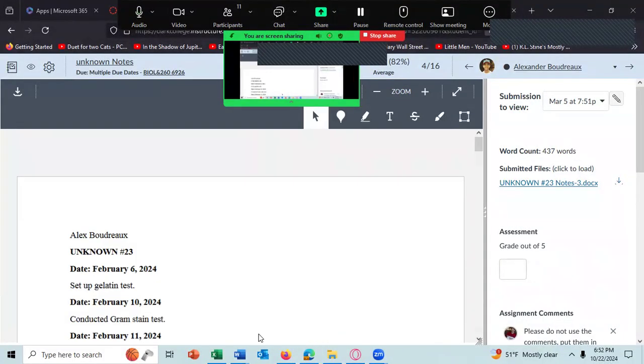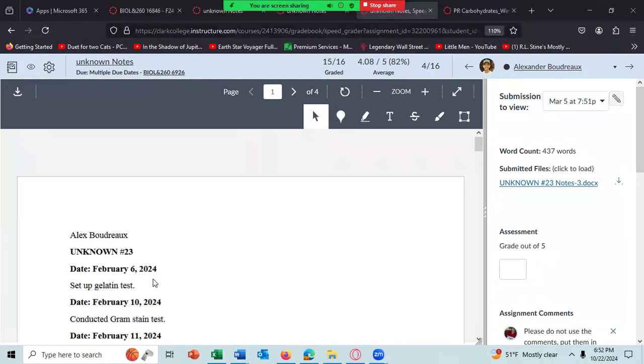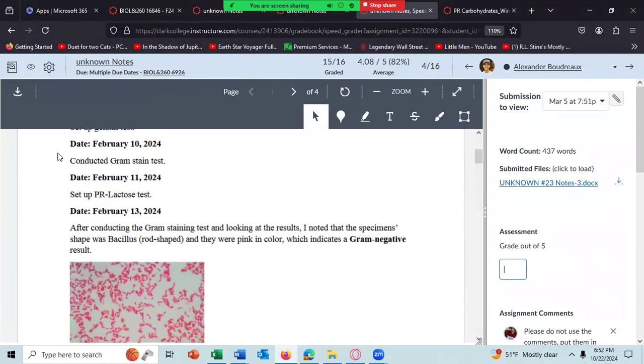So you will put your results, your conclusions, what species are under consideration, and anything else about your unknown project, you will put them in your unknown notes page. So on February 6th, the student said they were starting the gelatin hydrolysis test. February 10th, they started the gram test. On February 11th, they started the PR lactose test. And then on the 13th, they got the results from all of these tests.